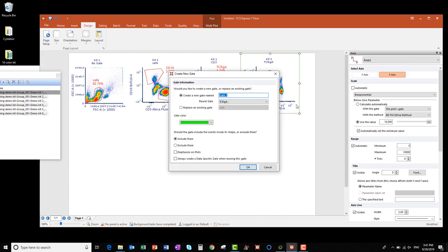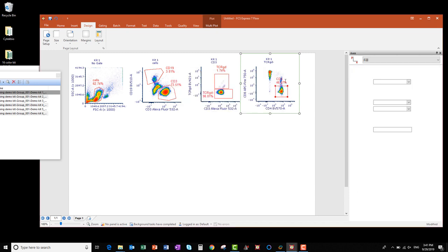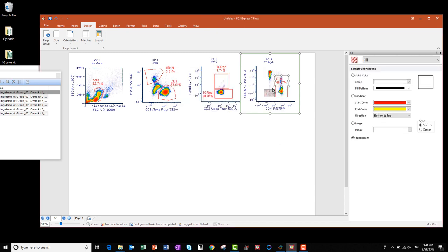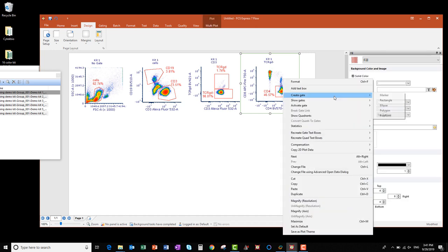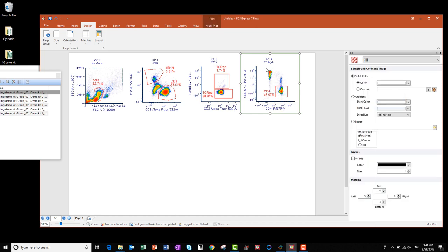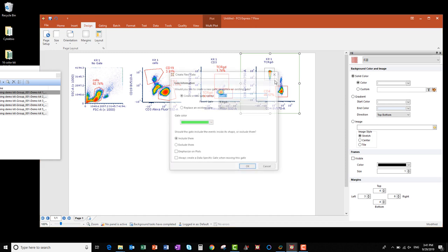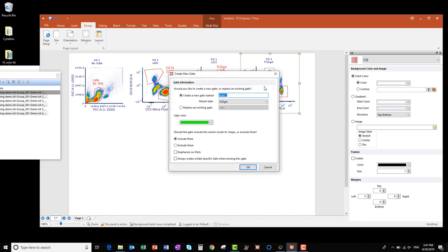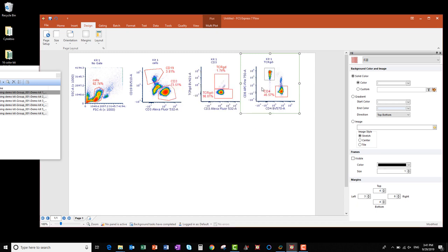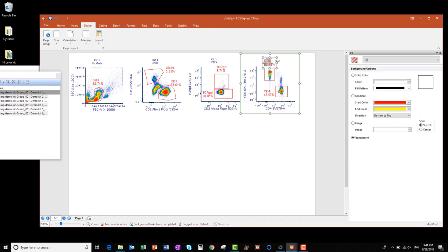This first one I'm going to call CD4, choose a gate color, and click OK. I'm going to move the CD4 gate label out of the way, and then create one more rectangle gate on the CD8 positive events. I'll name this one CD8, change my gate color, click OK, and I'm going to relocate the title of this gate too.